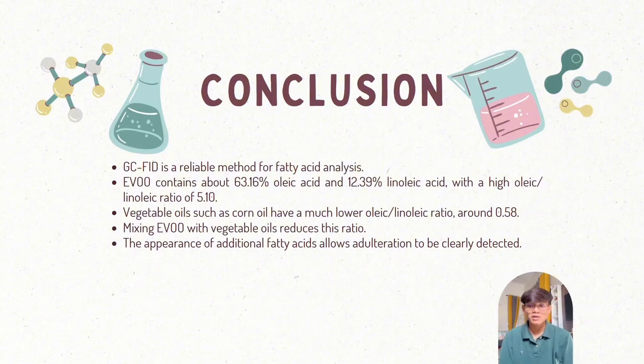when extra virgin olive oil is mixed with vegetable oil. This ratio decreased and additional fatty acids appear, making adulteration clearly detected.